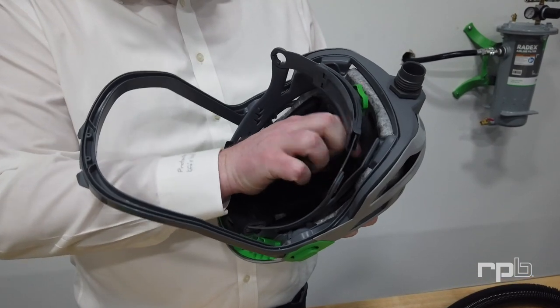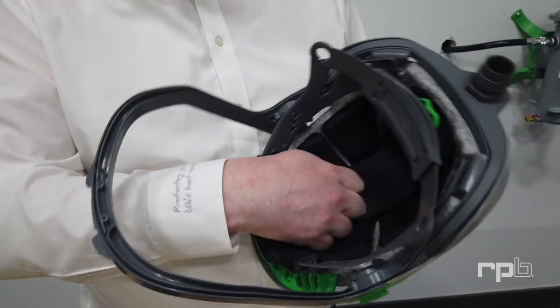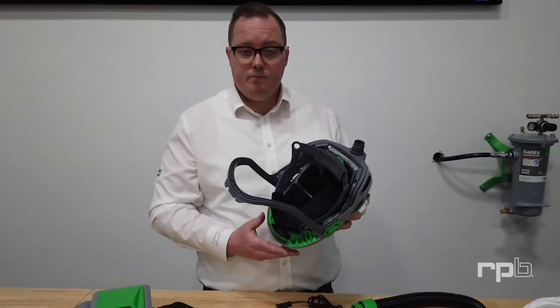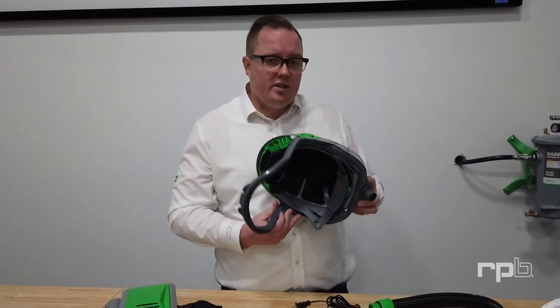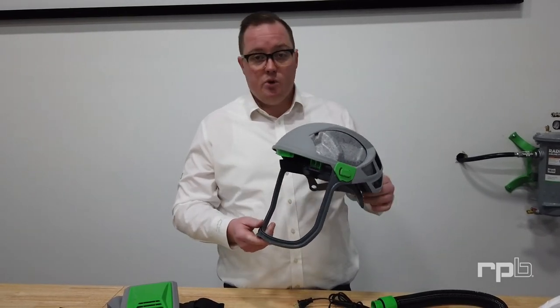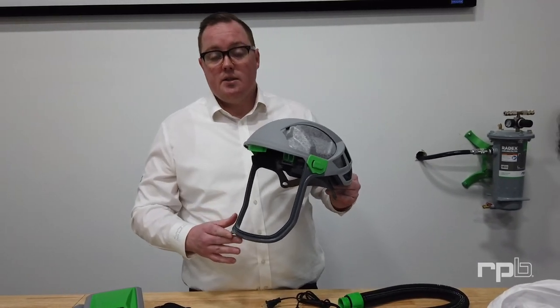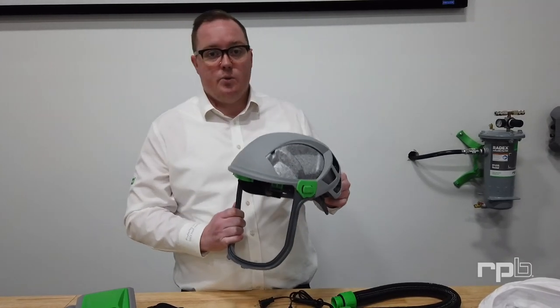RPB does not recommend sharing respirators, but if you do have to for whatever reason, you want to take extra precaution around protecting the hygiene of your operators. You'd want to wear hair nets, do-rags, or some other form of protection to give yourself a barrier between the respirator and the operator wearing it.